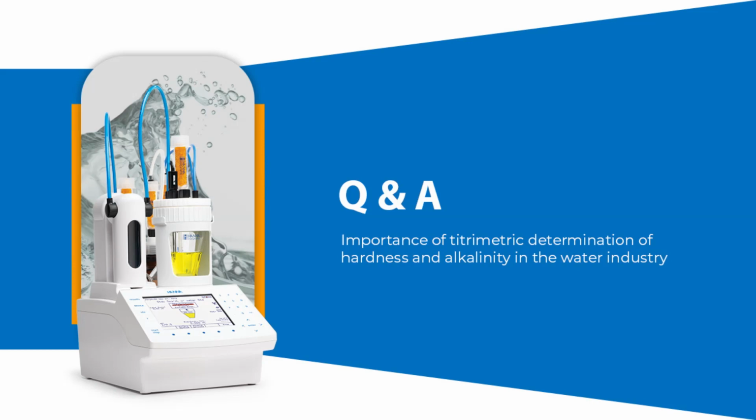Then there are some different errors depending upon the technical skills of the analyst. Reagent addition is one of them. So you have to add a particular reagent in a particular amount for the better results.